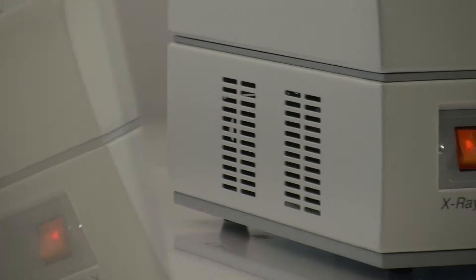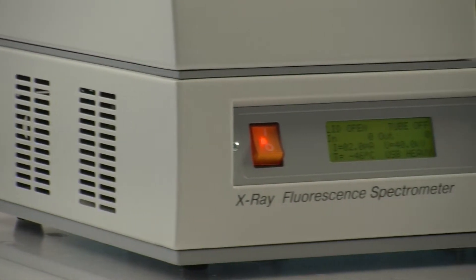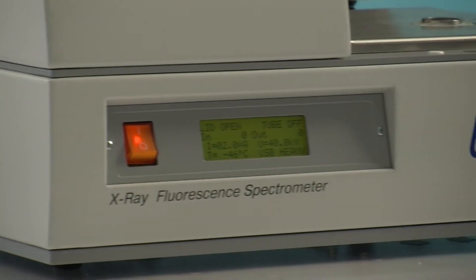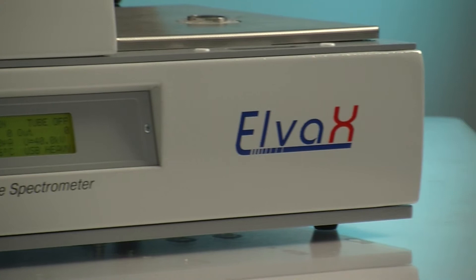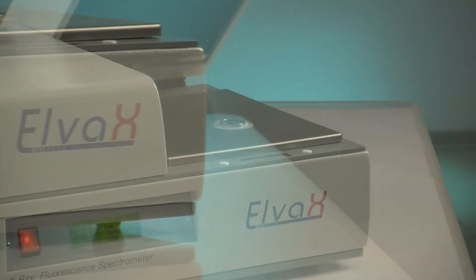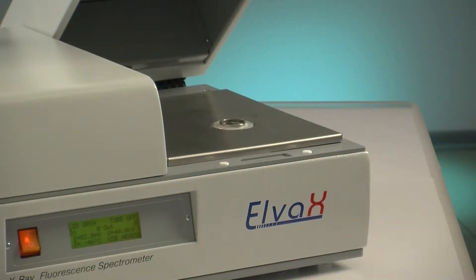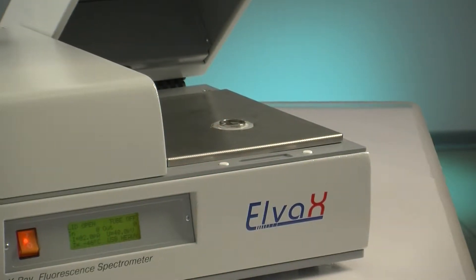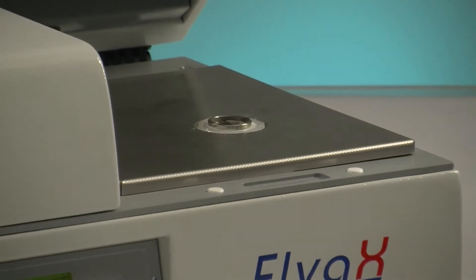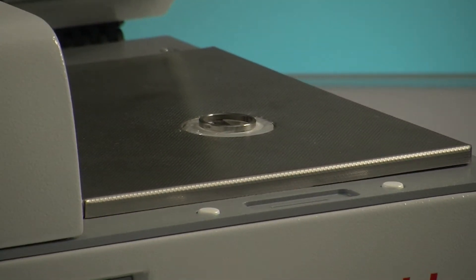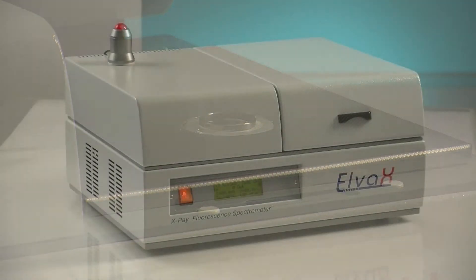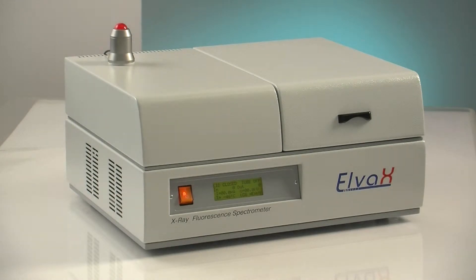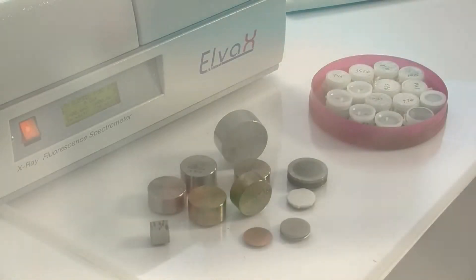Elvatec is capable of analyzing all kinds of material types, including solids, liquids and powders, with no or minimum sample preparation. Due to the use of a high-resolution SDD detector and helium purge of the analytical chamber, the instrument can detect light elements starting from sodium with superior accuracy and limits of detection.